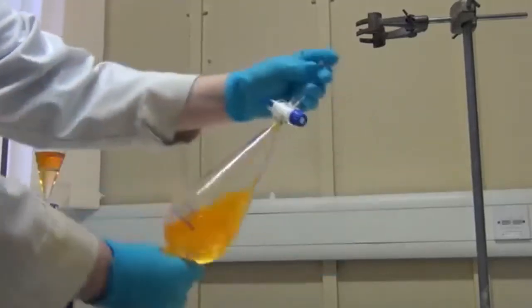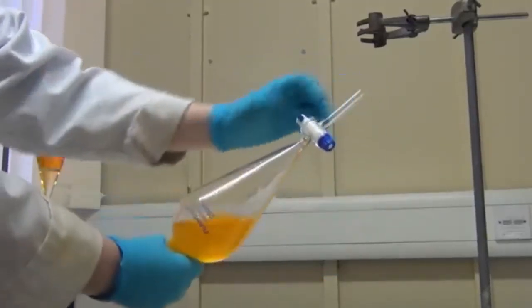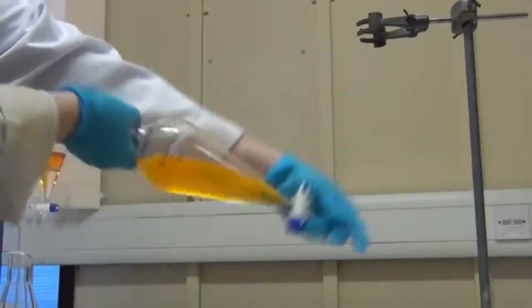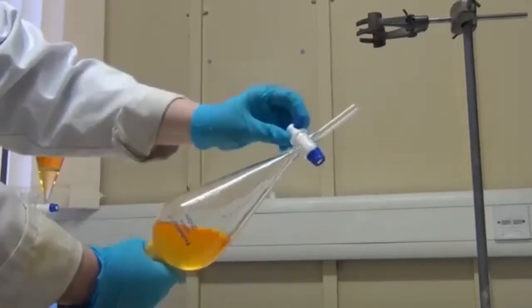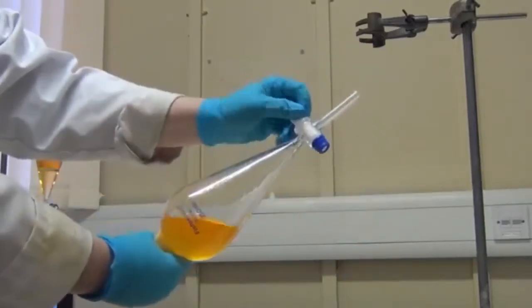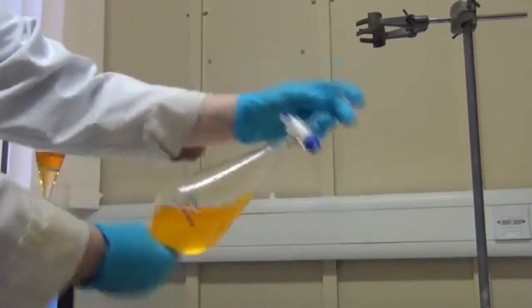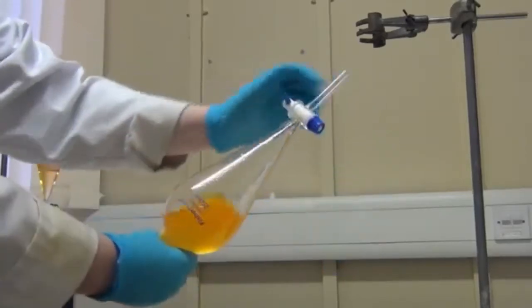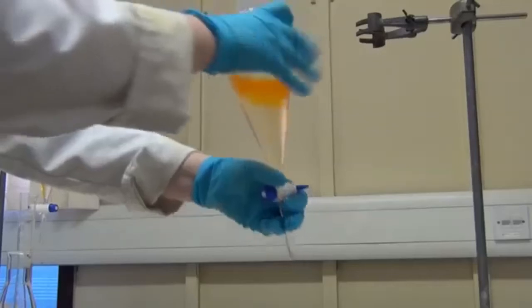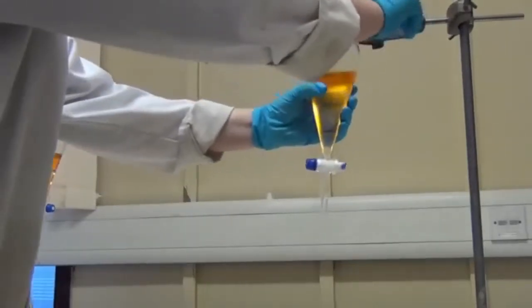Then using both hands, invert the funnel 2 to 3 times before opening the tap to release the pressure again. To ensure maximum mixing and maximum separation, you should repeat the process of 2 to 3 inversions followed by the opening of the tap another 5 to 10 times. Then securely attach the separating funnel back in the clamp or ring and watch the layers begin to separate.